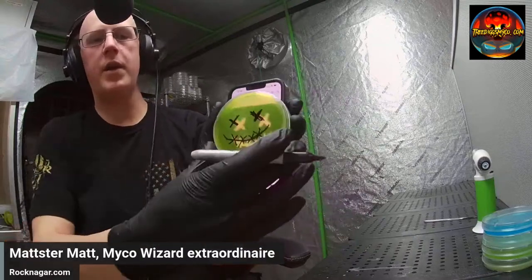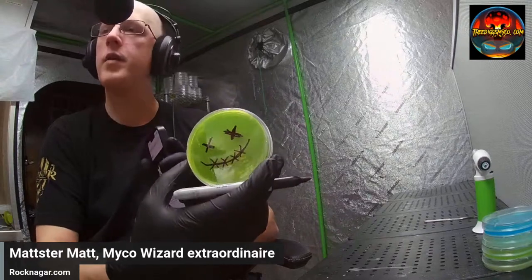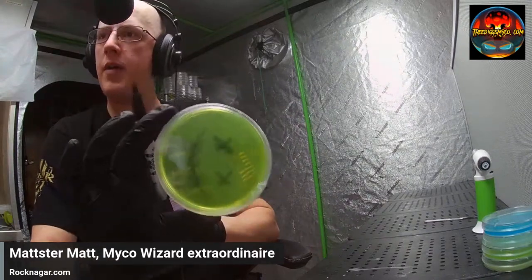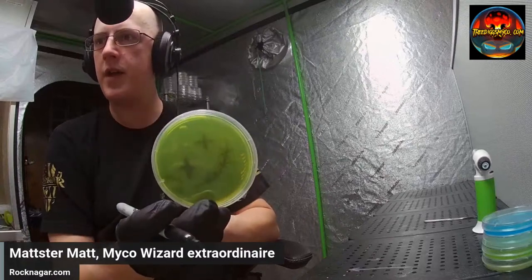All right, that's what we got there. Then we'll clean this plate off, set it there, look from the top, and just cut that design out with our scalpel. Easy peasy.